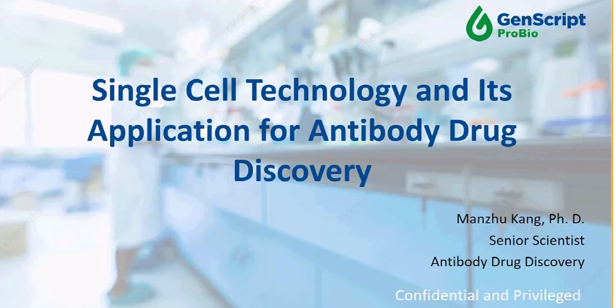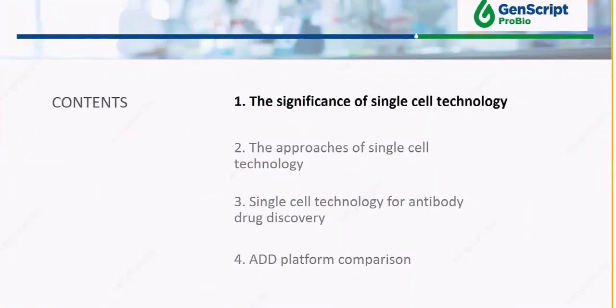Today I'm going to talk to you about single-cell technology and its application for antibody drug discovery. The webinar is going to be divided into 4 parts: the significance, the approaches, single-cell technology for antibody drug discovery, and ADD platform comparison.